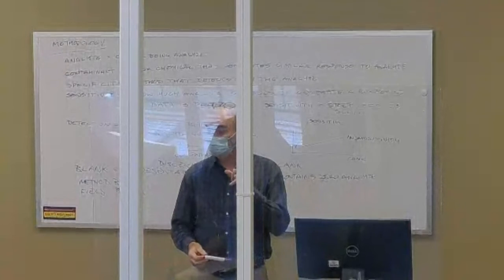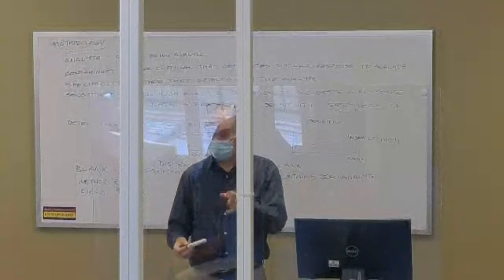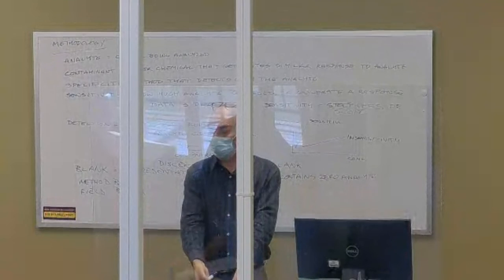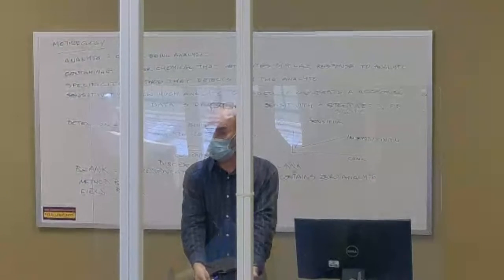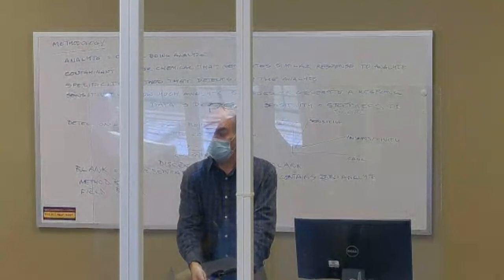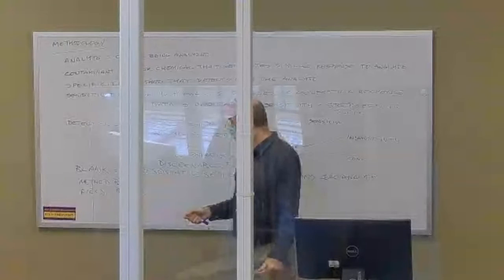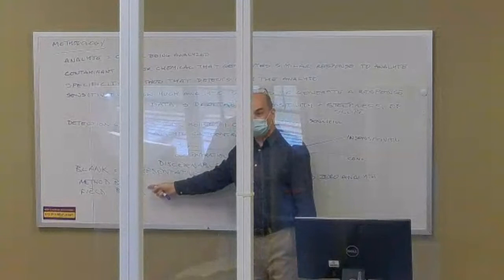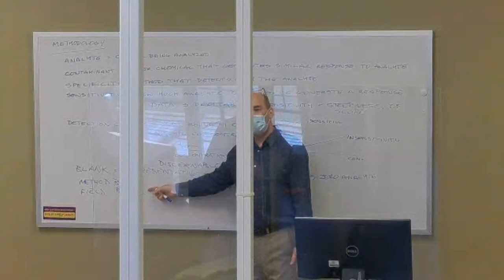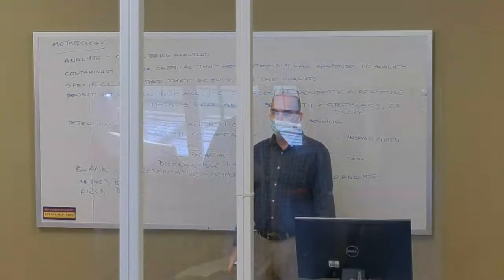Okay. So now it's your job to sample. I've got a bottle. I'm a concerned parent. Is this bottle contaminated? Your blank is a method blank. It contains everything that's supposed to be in the sample except the thing that you're looking for.